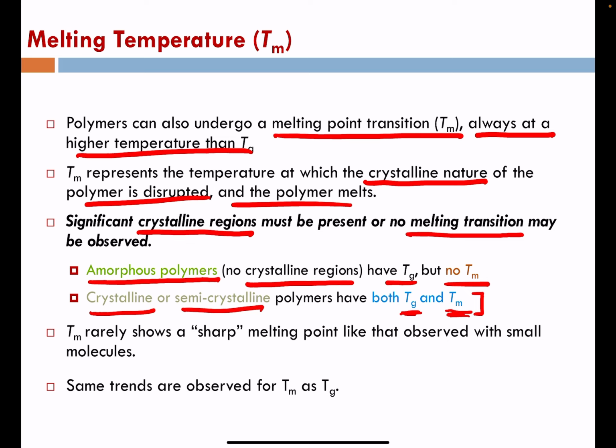If the history is more routine or very much programmed to favor crystallization, there will be lots of crystallites to detect, and we will see a large signal for TM at the expense of a more muted TG signal. So that is to say, in semicrystalline polymers, the amorphous material is in balance with the amount of crystalline material and vice versa.